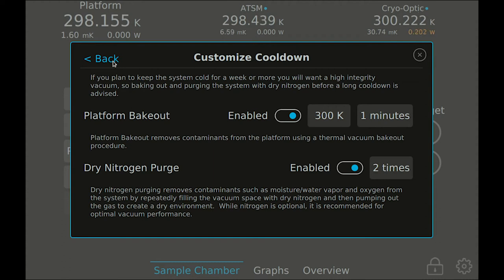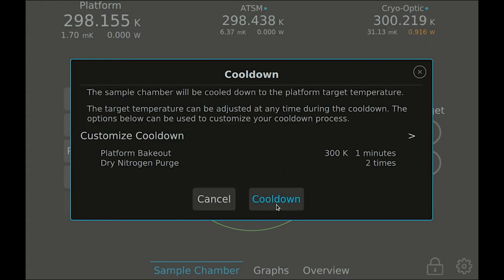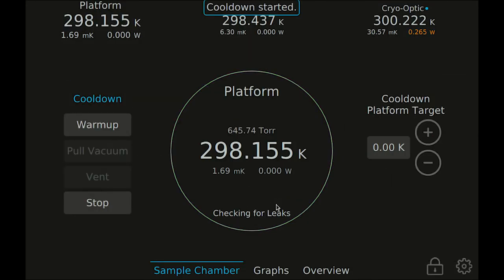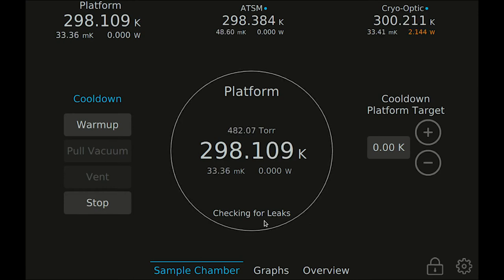When you are ready, navigate back and press cool-down to begin. I am using a short bakeout to demonstrate the bakeout process. Press cool-down to get started. The first part of the cool-down will check your system for vacuum leaks. If any leaks are detected, the cool-down will be aborted. You will know that all leak checks have passed after the system's status no longer says 'Checking for Leaks.'